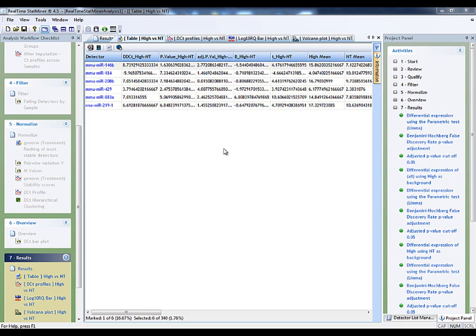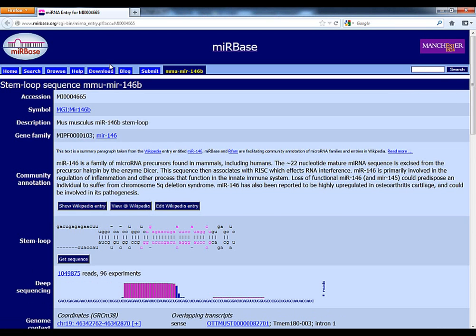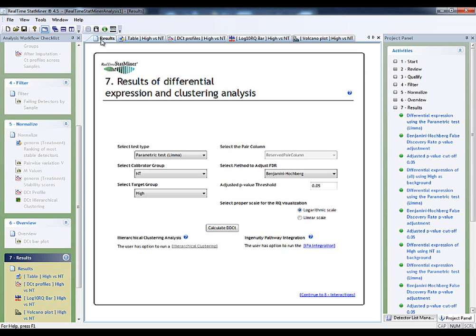As we can see, the detectors are now highlighted, indicating that if we click on them, our search will be visualized in our predefined web browser. Let's try with this detector. And that is all. We now have access to the Sanger knowledge base with full information about our detectors of interest. Let's continue this tutorial by addressing another question that we previously asked.